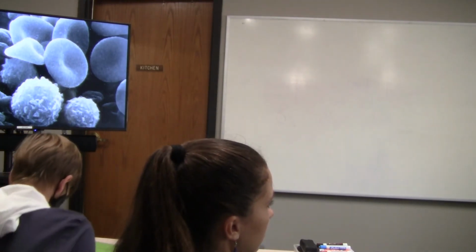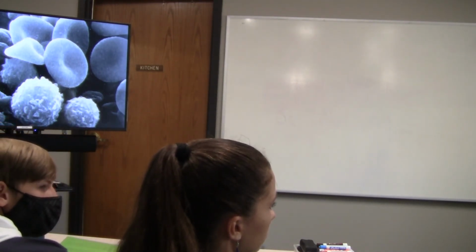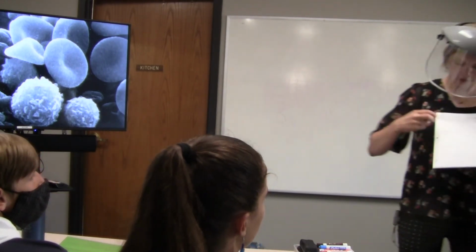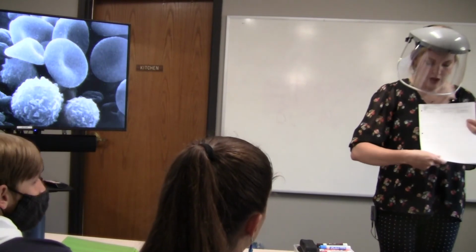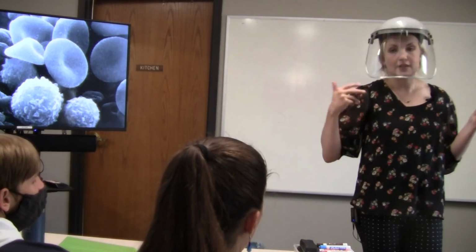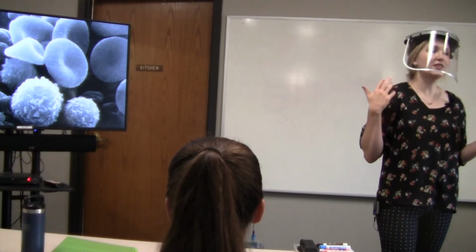Now most of your slides you're going to analyze, and you'll be able to come up and choose 3 slides of your choice, and you'll be taking some notes on those slides. So what I want you to do on this side of the lab is you're going to have 3 different objects, 1, 2, 3, and then for 4 times, 10 times, and 40 times, to the best of your ability, I realize this isn't an art class, draw what you see. And use words to describe it.